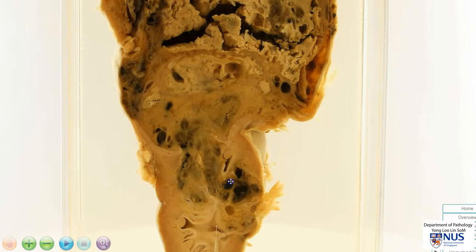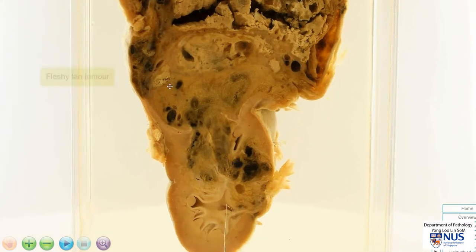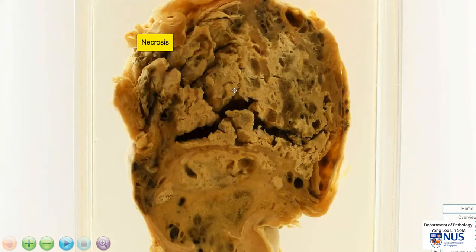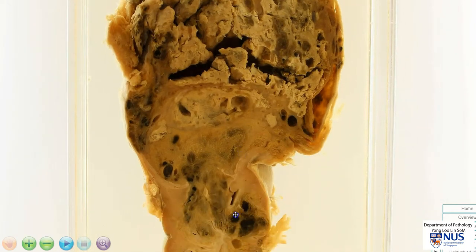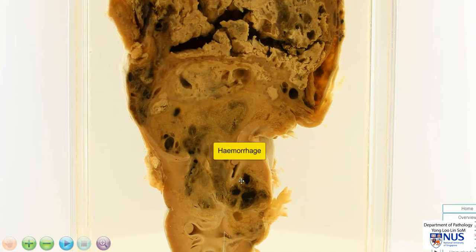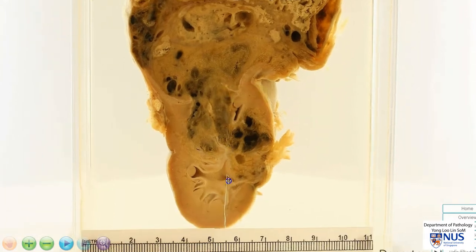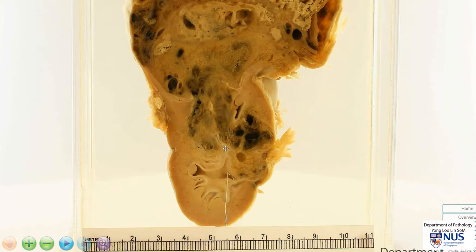Looking at this more closely, we can actually see the tumor is fleshy and tan, and it has these geographic pale areas of necrosis. In fact, in some areas the tumor is very friable and almost cavitating — all these pale areas are necrotic. We also have darker areas of hemorrhage, and the tumor is abutting the renal pelvis. We can see it is really compressing on the renal pelvis with the calyces.